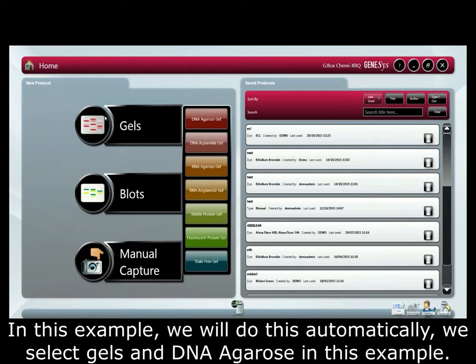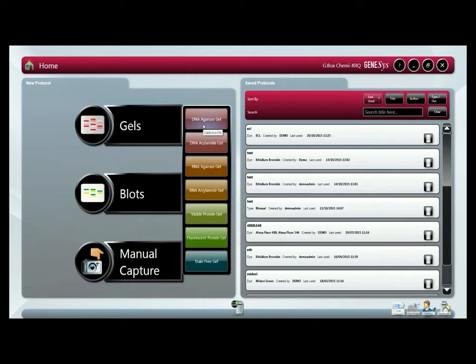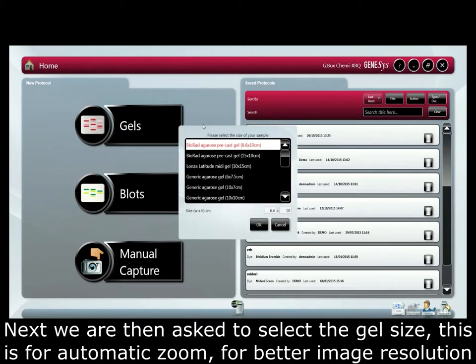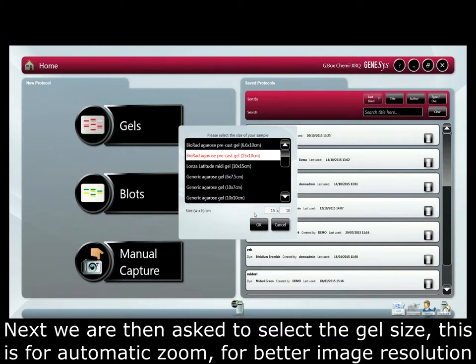We select gel and DNA agarose in this example. Next we are then asked to select the gel size. This is for automatic zoom for better image resolution.